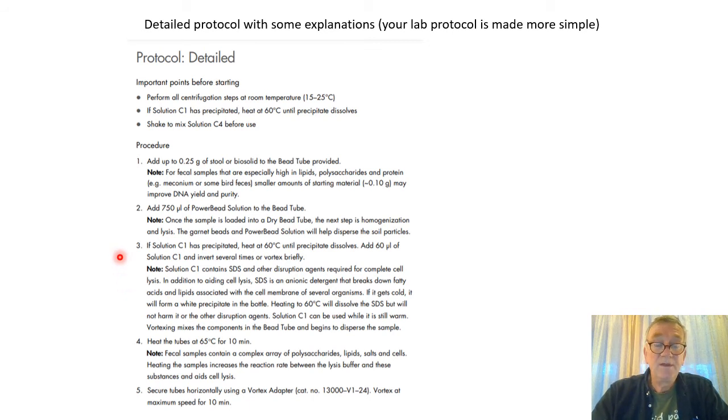The C1 solution contains SDS. And SDS is actually a soap, and you know what soap does? It binds to fat and makes the fatty acids be disrupted. And there's a lot of fatty acids in cell membranes. So this C1 will help breaking down the cell membranes.